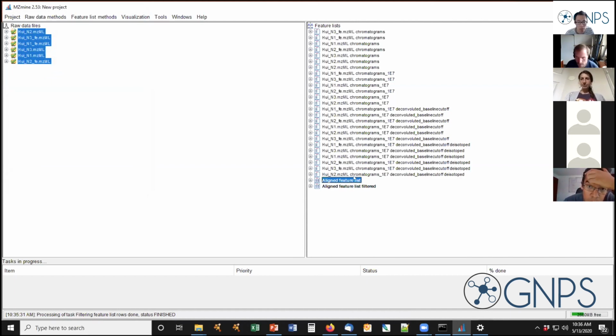But hey, Daniel, yeah, there's 2 questions. So the first is that, so we've already done de-isotoping. So someone is wondering why we set minimum isotope peaks to 2. That actually makes use of that isotope grouping. So that did not group isotopes, but it only allowed features that had 2 isotopes in there.